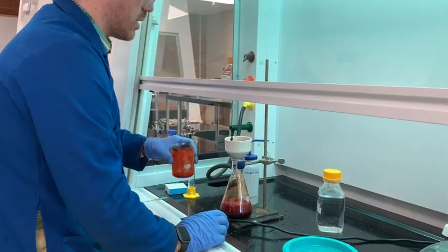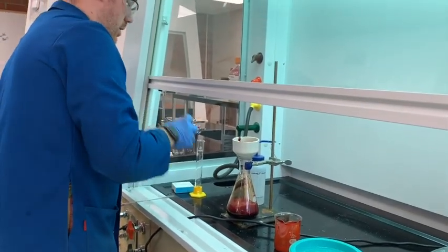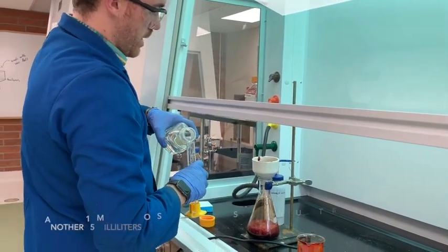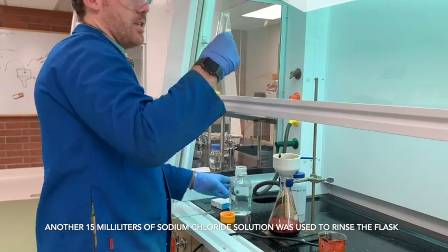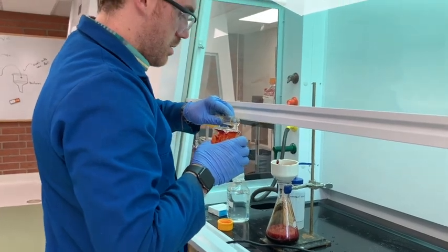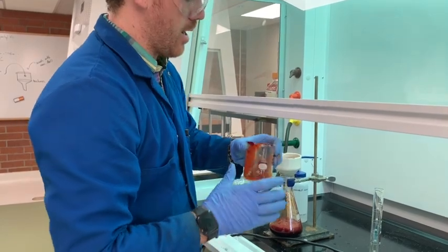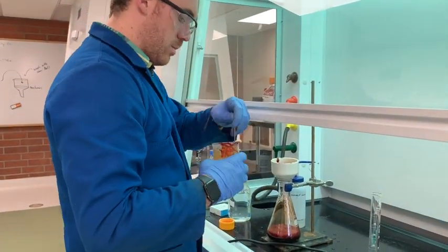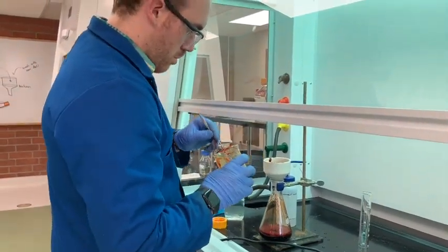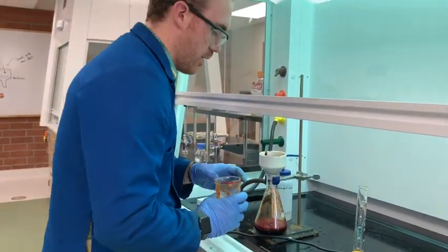Alright, so I'm going to see if I can get a little bit more of this, and it'll also act as a dual purpose of rinsing the product on top. It's going to take about 15 milliliters more. Yep. And try to get as much of this product as I can. Don't want to stain the new lab materials.